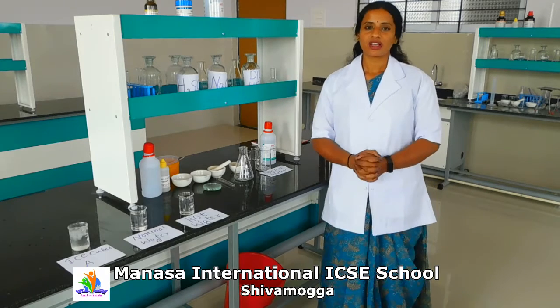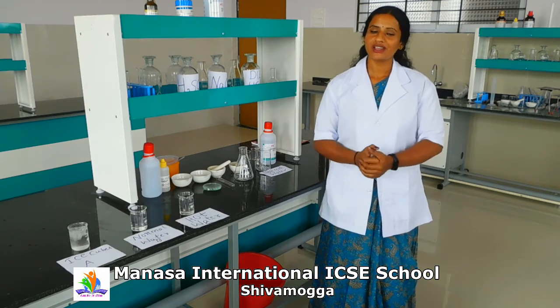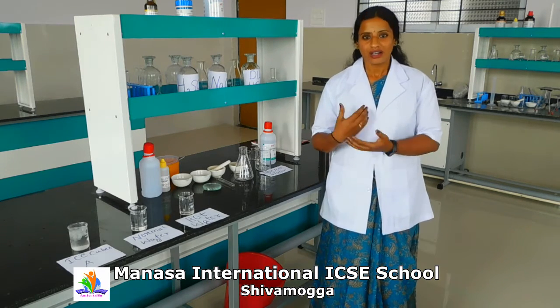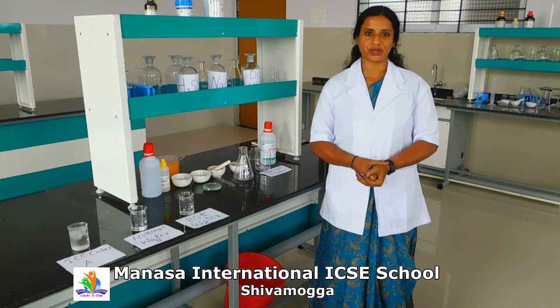Hello dear students, as I'll keep on telling, chemistry is a very interesting, colorful subject. Now in this class, let's know how the chemistry laboratory is designed, what precautions are to be taken, and what apparatus and materials are found in a chemistry laboratory.